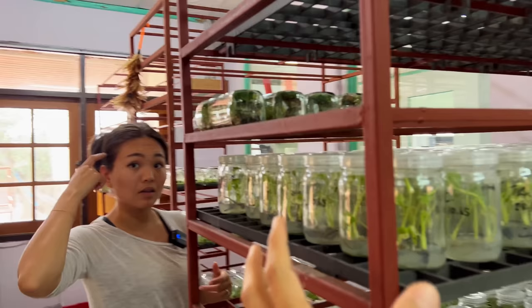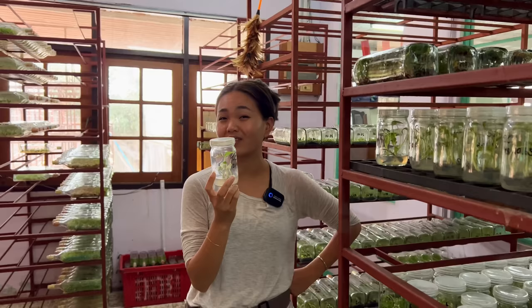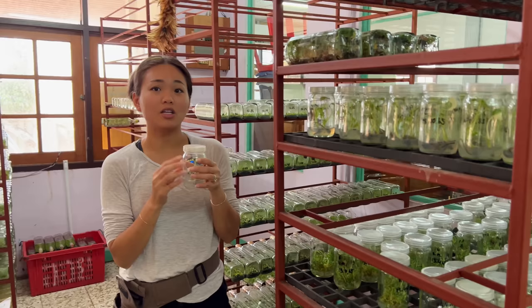They're actually easy to ship like this. When you ship them, do they have to be kept upright? They can turn, but we don't like that. If we ship internationally, there's nothing we can do, but it'll be fine. The receiver needs to know how to deal with these.